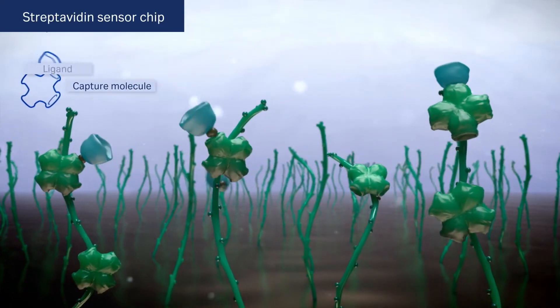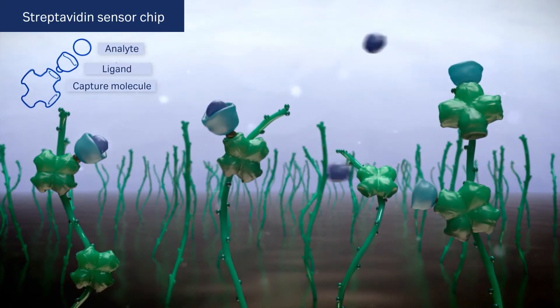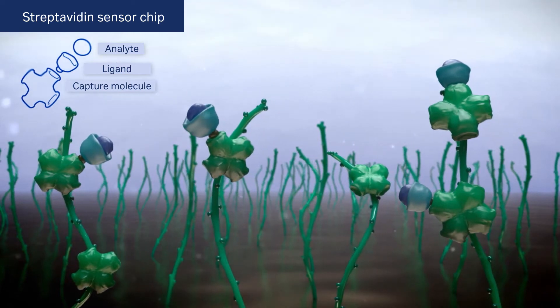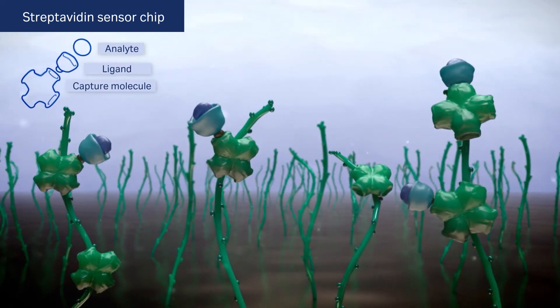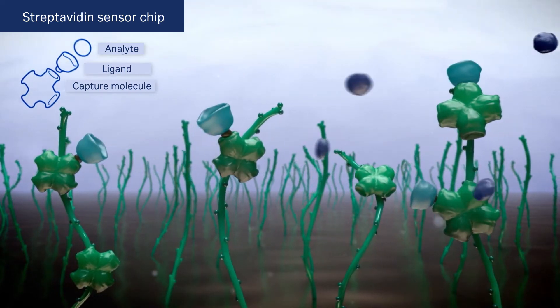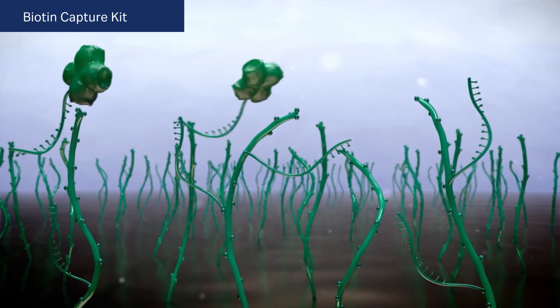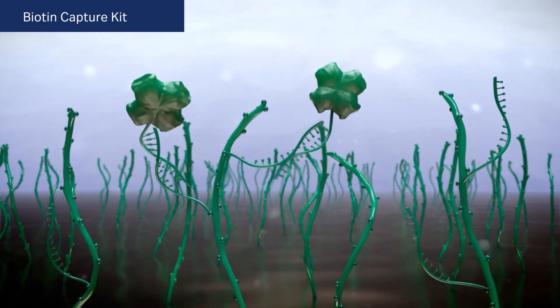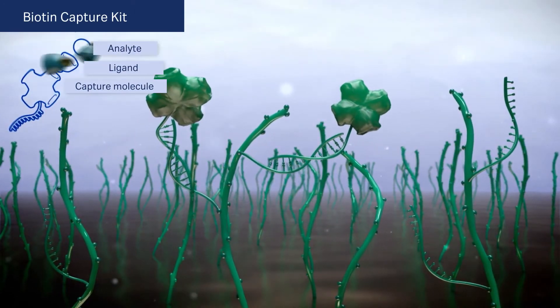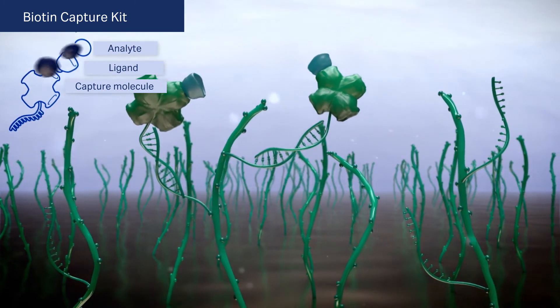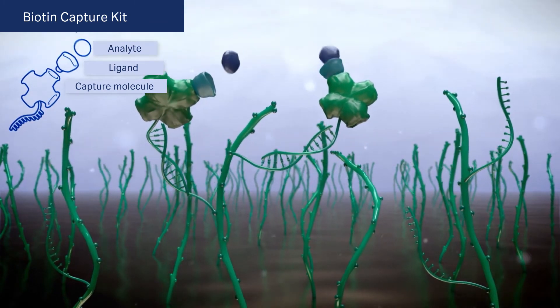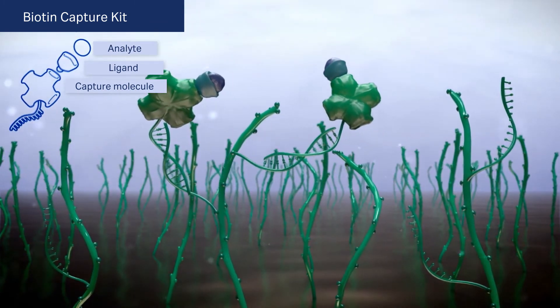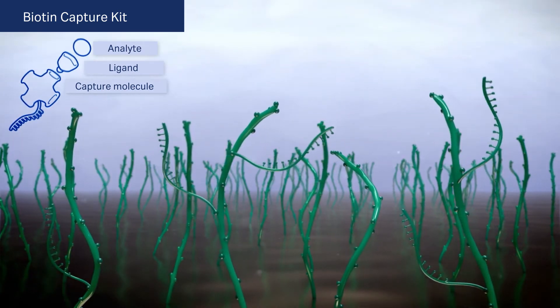Biotinylated molecules can be captured on pre-immobilized streptavidin sensor chip and the ligands cannot be removed by regeneration. Biotin capture kit is the choice for reversible capture of biotinylated ligands using hybridization of single-stranded DNA to attach streptavidin to the CAP sensor chip.